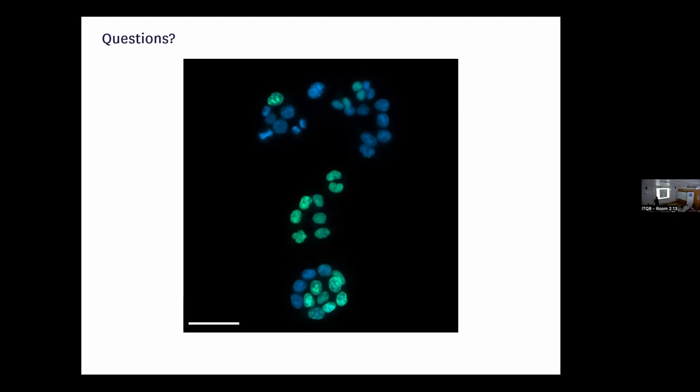Would they interact, or is it a bigger distance? Not sure if I follow the question. So you're labeling membrane components with the fluorophores. The membrane itself. I'm talking about bacteria. Of course, you have a fluorophore that binds to membranes that are intact, and then you have another one that binds to bacteria that have a compromised membrane.